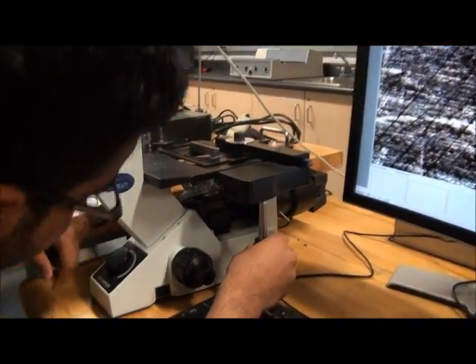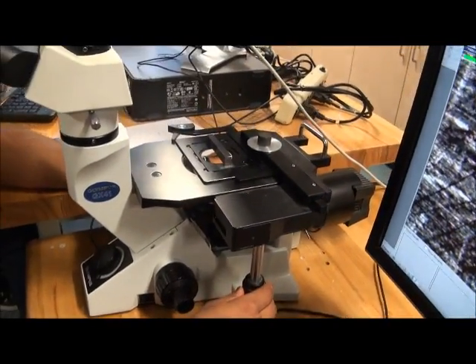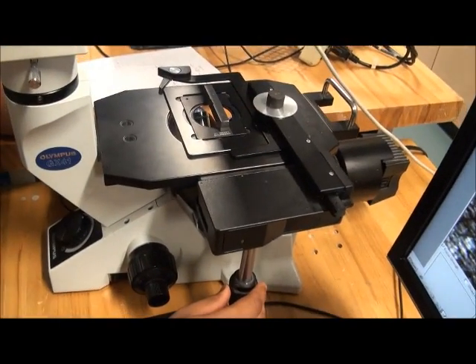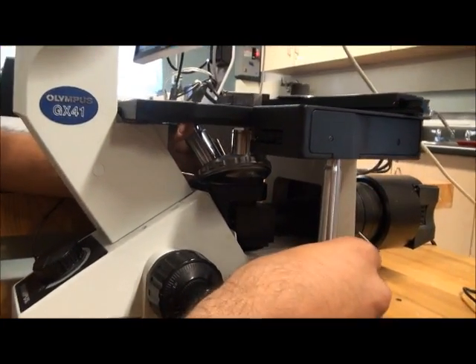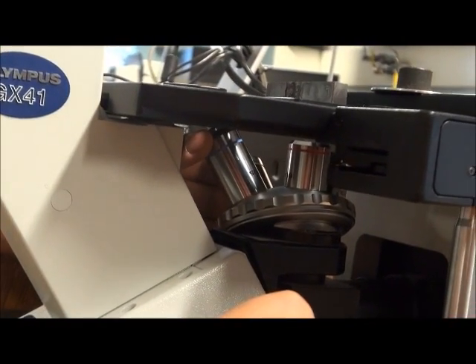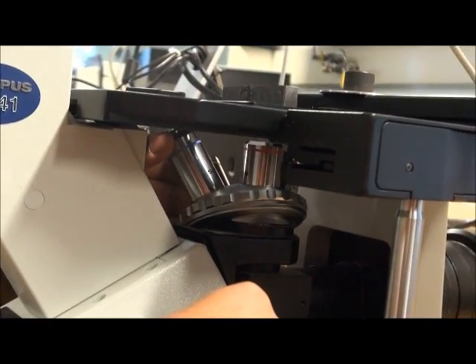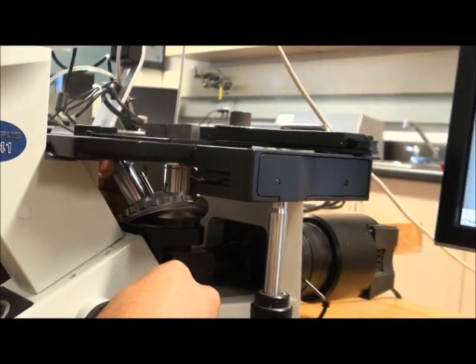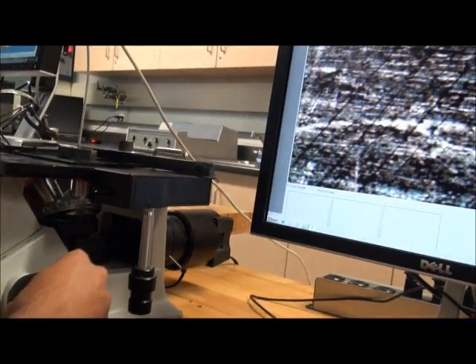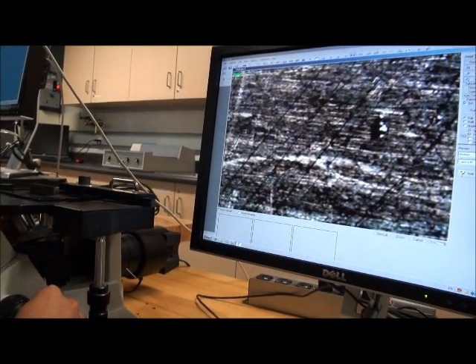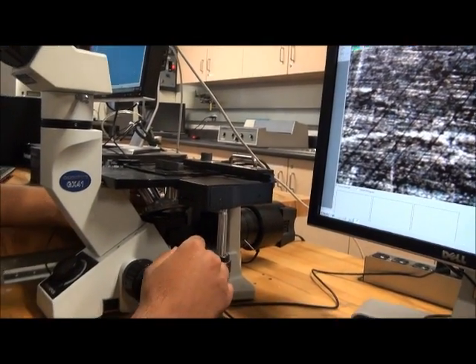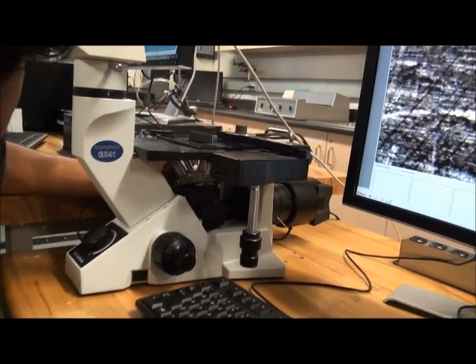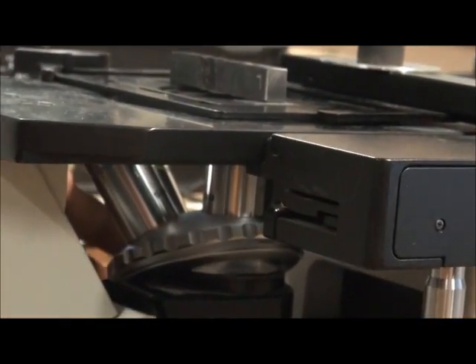First, I am going to start with the lowest power lens, that is the 5x. Here, I can move this for focusing the sample. I can move the objective lens for more powers as well.